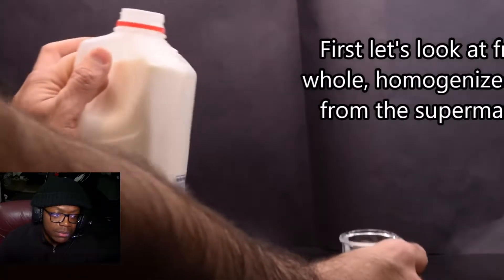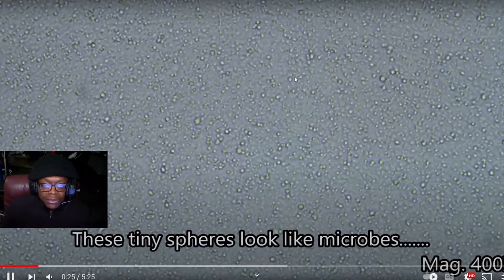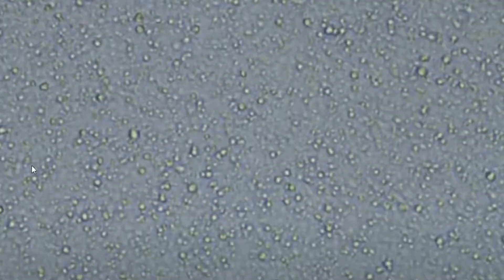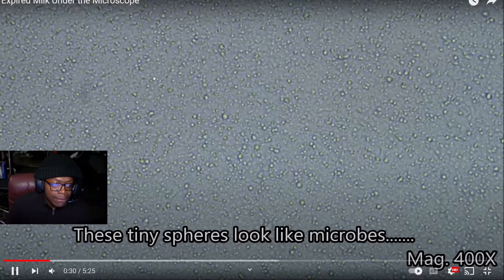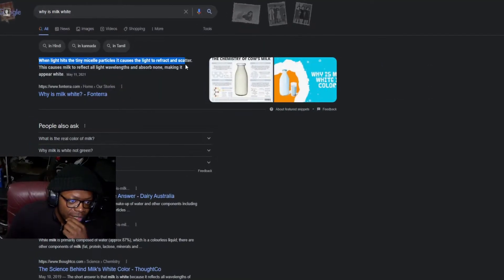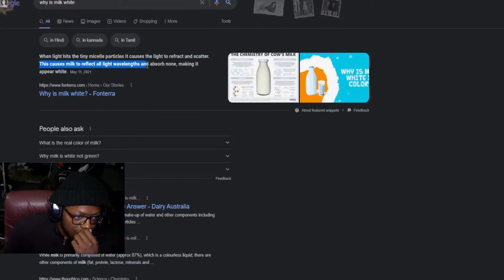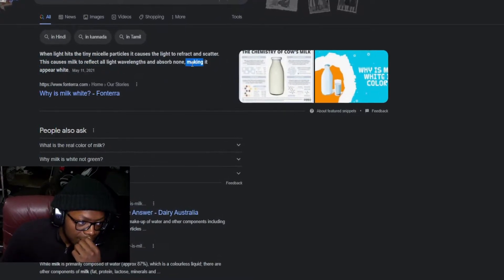This is ordinary milk under a microscope. These tiny spheres look like microbes. Where does it get its white color from? When light hits the tiny micelle particles, it causes the light to refract and scatter. This causes milk to reflect all light wavelengths and absorb none, making it appear white.